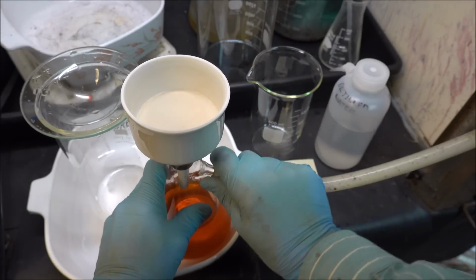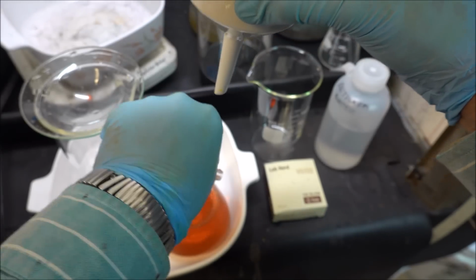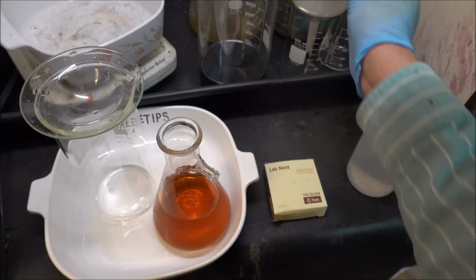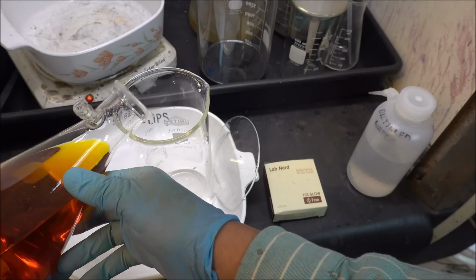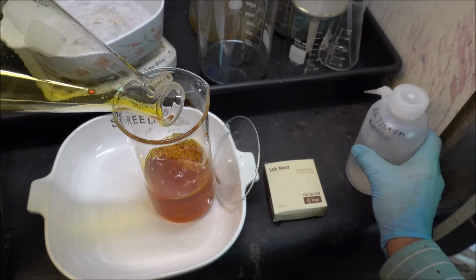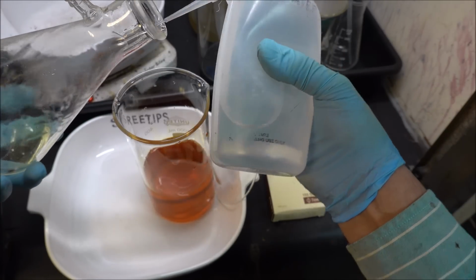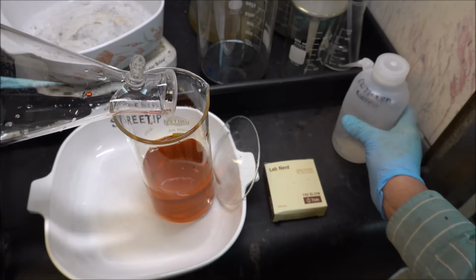Okay, everything's been pulled through the filter now. What we'll do is get the funnel off of here, rinse any gold off of it down into our flask. Set this over here out of the way. Now we'll transfer the gold bearing solution into our beaker here. And then once we get it in here, I'm going to precipitate the gold here another time with some sodium metabisulfite. See if we can do this all in one take here.